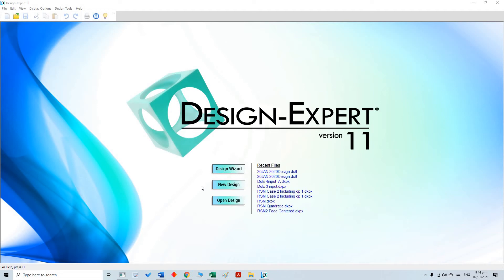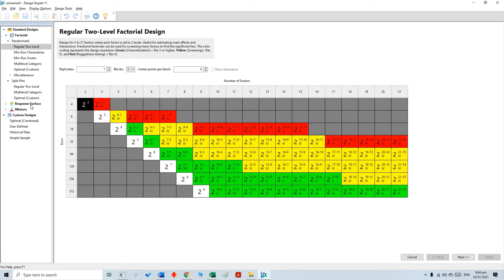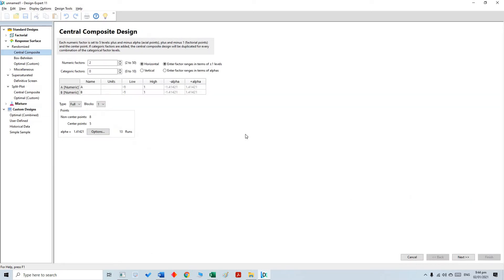Hello, Asalaamu Alaikum. We are going to explore Design Expert software version 11, which is used to design experiments. In order to minimize the number of experiments, this is the best technique. We will start with a new design and discuss the response surface methodology.